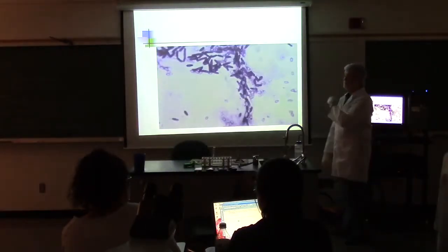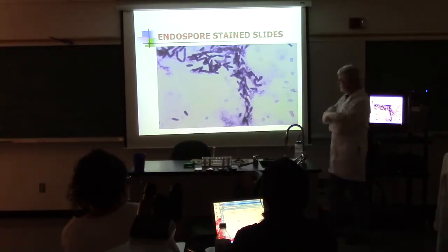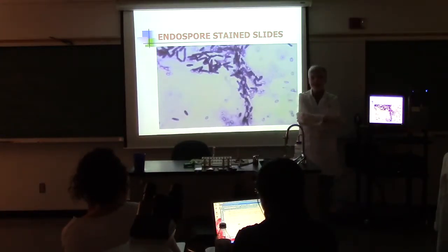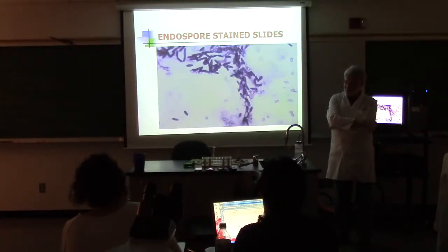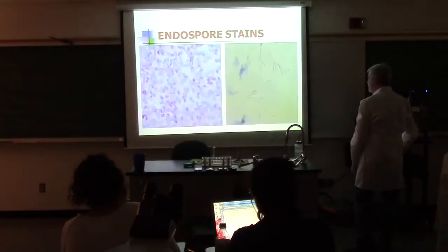All right, gram stain. Is it going to be endospore positive? Yes, you can see the endospores. You can even see the holes. So when you do your gram stain on the lab practical, if you see holes, what do you know your endospore is going to be? Positive. So you already got the answers. So, you know, use some logic on these.